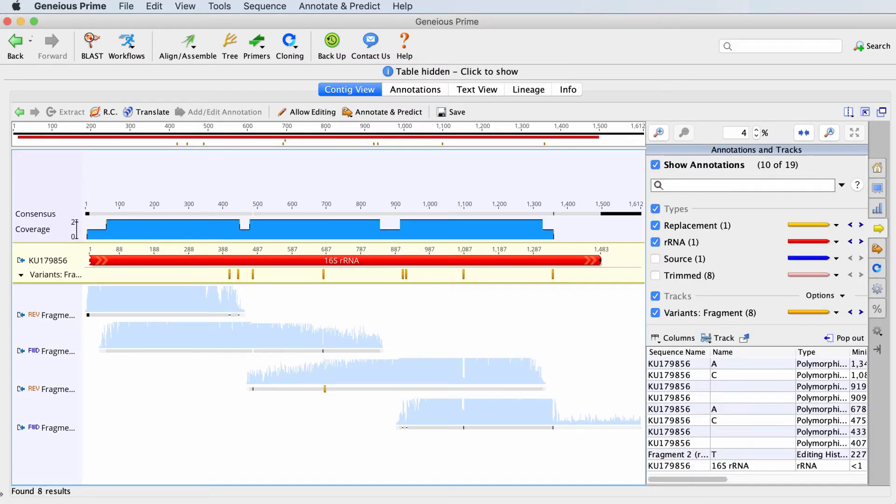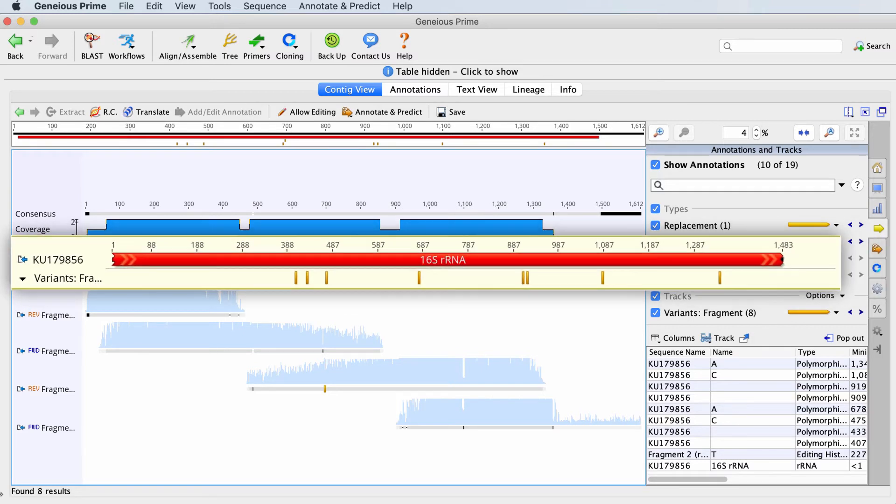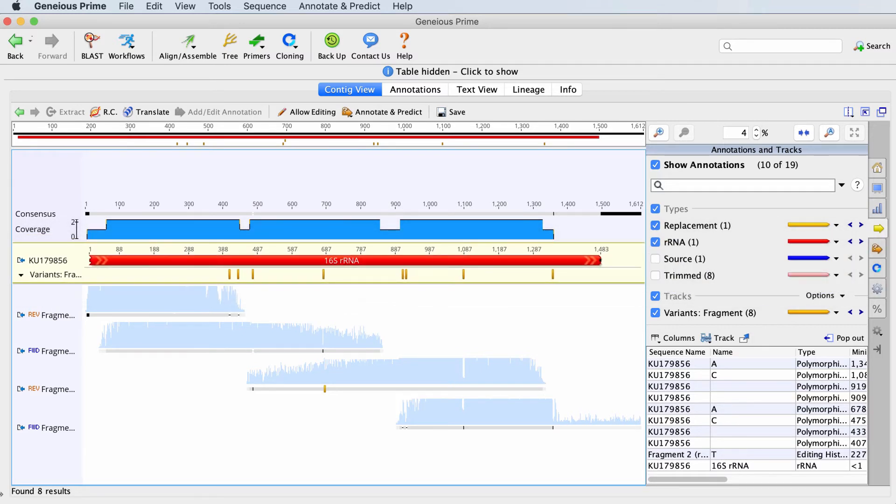Let's click OK. You should now see an annotation track called Variants added to the reference sequence.